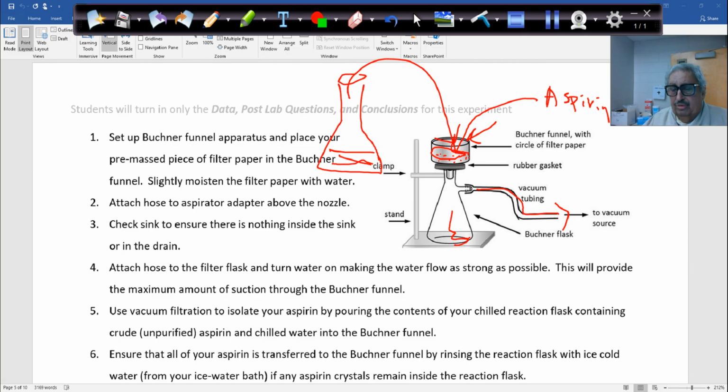So you take it out, and next week you test for the extra acetic anhydride, if it's still there. We'll test all the reactants to see if they are still there or have already fully reacted. We'll do the iron trichloride test for the phenol. Has all the salicylic acid reacted?